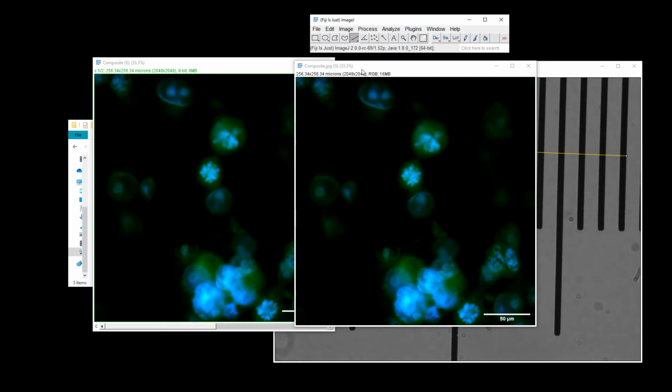So this will save as an RGB formatted file, so that for your final lab write-up, it will be in RGB format for printing purposes. After finishing that, we can close this out now. Essentially, you have your composite file saved.